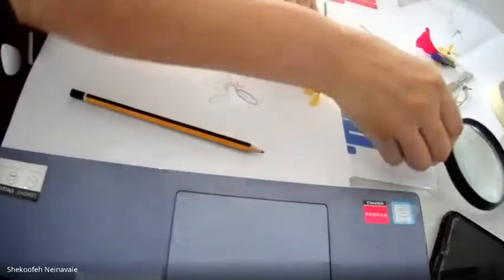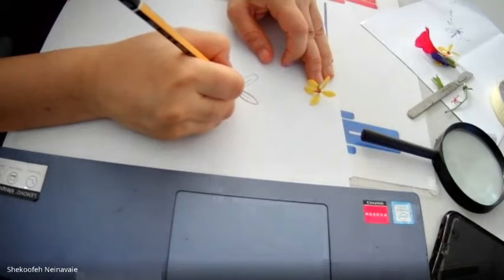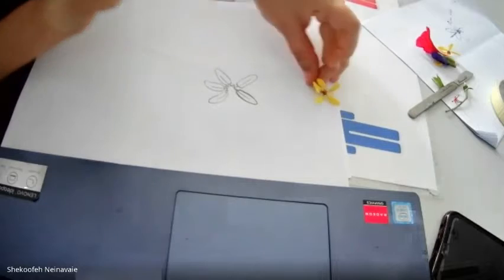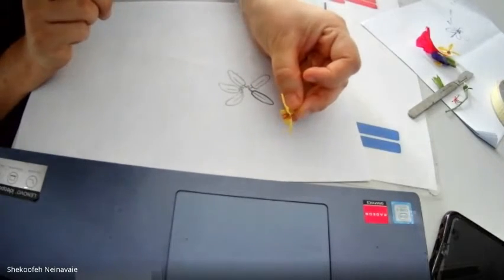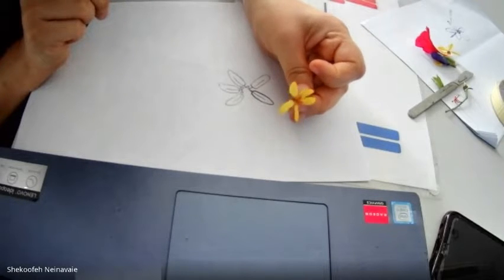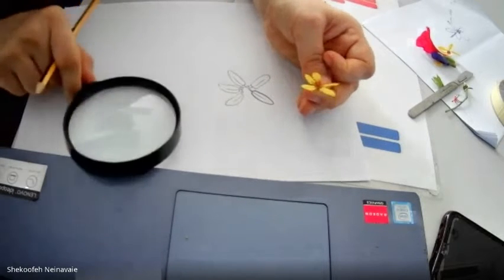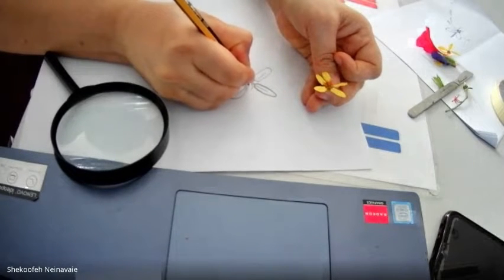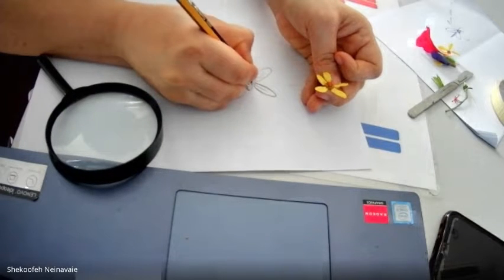1, 2, 3, 4, 5. It has 5 anthers or 5 stamens. So I draw them, and the shape of them, once more I look at them from very close to see how they may look. They're all shorter than the female. So this is how it may look like. 1, 2, 3, 4, and 5.